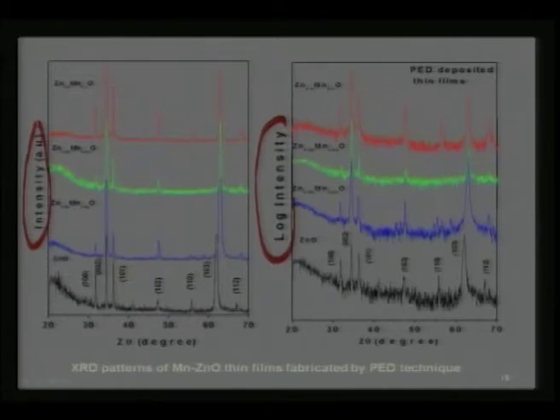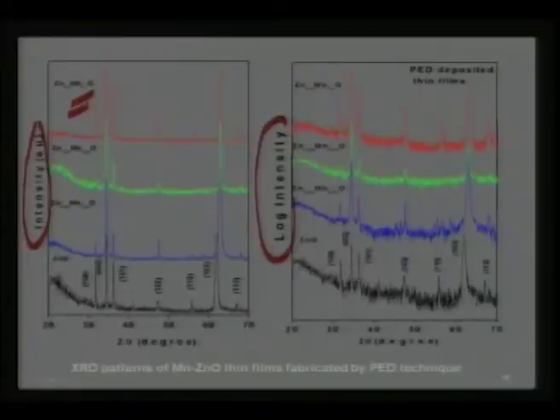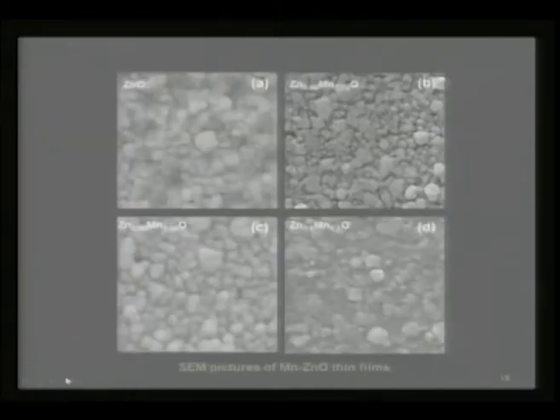If you grow this zinc oxide, you can clearly see they show very clean features, and you would not expect any sort of manganese impurity in these ZnO films. Therefore, one can clearly walk away with the understanding that manganese is getting doped, and in this case you can also see that you can dope even 10% of manganese without any trace impurity for manganese here. So, having said that, look at the microstructure.